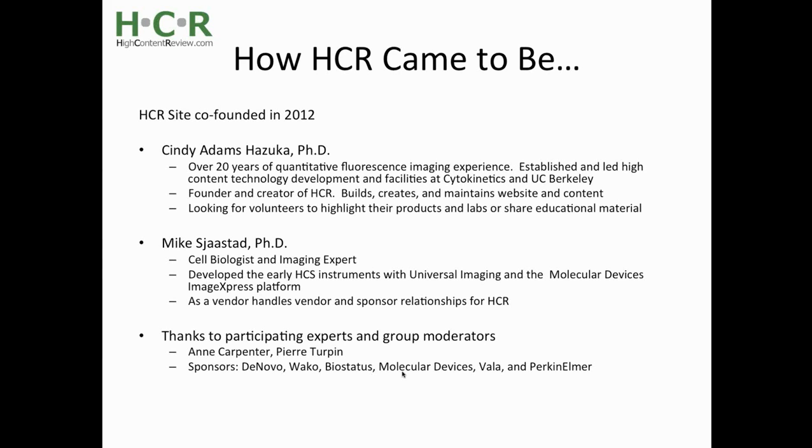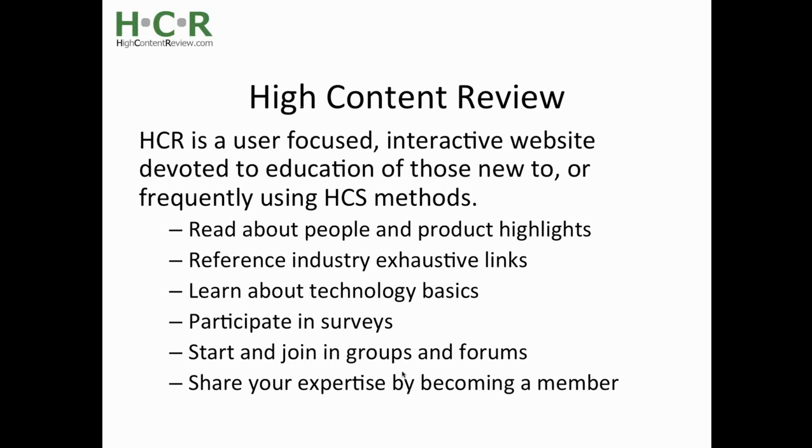And so both Mike and I really felt that there was a dire lack of a consolidated place on the web that we could direct people to for learning more about high content screening and analysis, and just simply set out to create one. So our initial goals for High Content Review are to really create a focused user group and an interactive website devoted to education and information for people who are new to or frequently using high content screening methods.